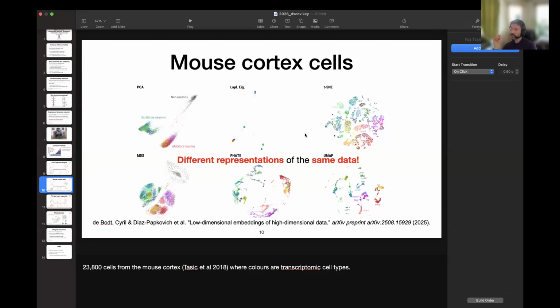What you could do is get all of these gene measurements from, say, 20,000 genes, but it's really hard to figure out how to bring them together in one way or another. Now, we know lots of genes are highly co-expressed in different cell types.